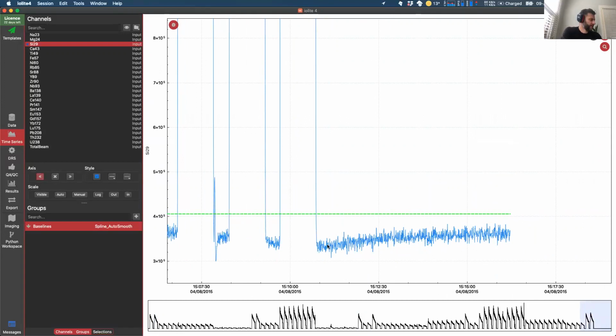So I'm going to hold down the Control key for Windows or the Command key on Mac and drag out another selection. You can see the mean changing and the 2 standard errors. Actually, the 2 standard errors don't decrease a whole lot as we get more data points, because the actual mean of the data is increasing. But you can see it changes as we select more data.